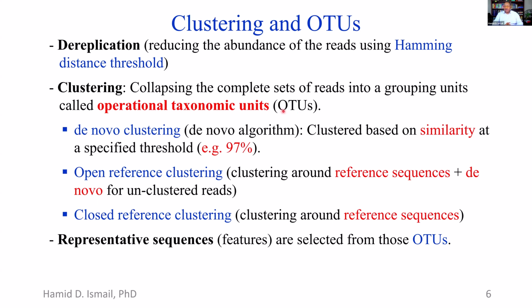That means if you have many bacterial communities, they are very diverse. So we expect that if some sequences have 97% similarity, then we assume that they may be from the same taxon. They relate to the same genus, species, strain, and so on. So this is the assumption right here. If it's less than that, it might be from a different group.